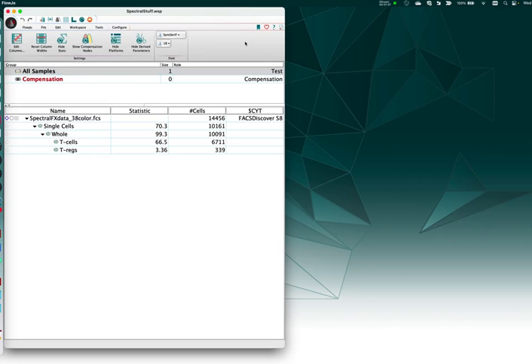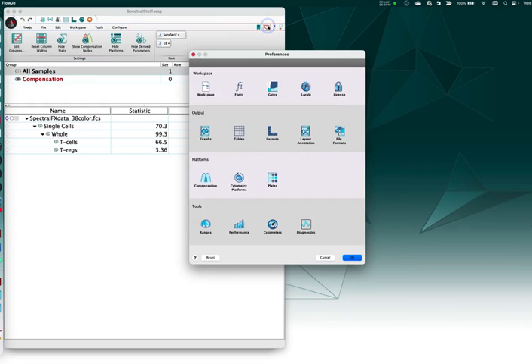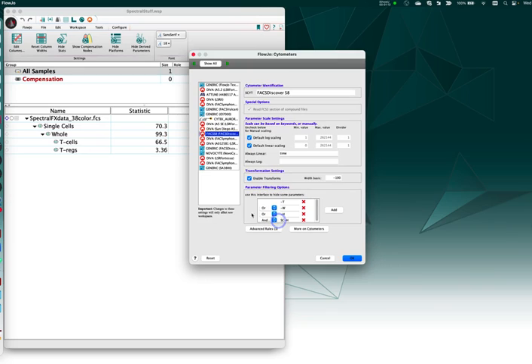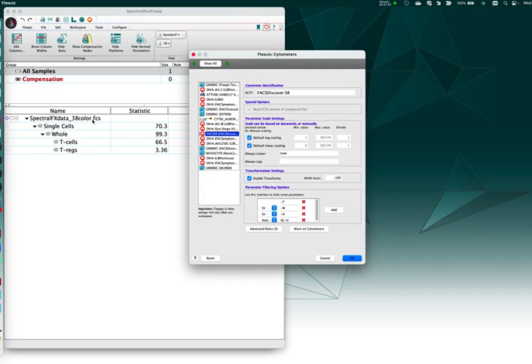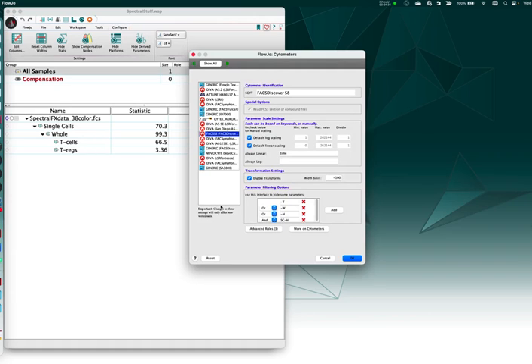You will also now see under the preferences that cytometers contains advanced rules. I've dragged in a file from the S8 FACSDiscover, and I would like to create some custom advanced scaling preferences for this tool. This can be done on any cytometer you want. I wanted to highlight the S8 tools here just because there are a lot of parameters that come with this new cytometer.